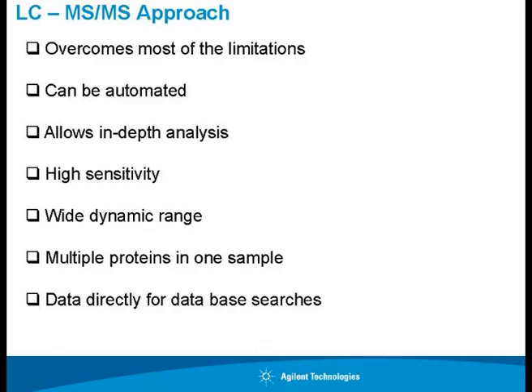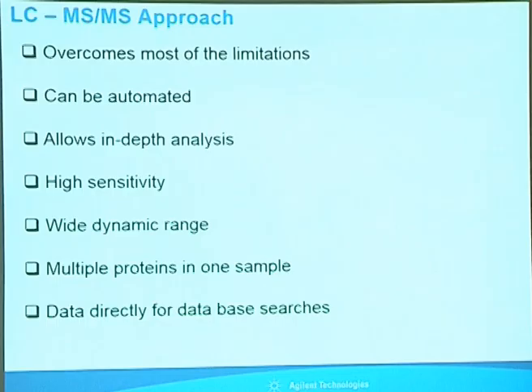It allows in-depth analysis. It is highly sensitive. It has a wide dynamic range, okay. And you can run multiple proteins in one sample at a time. And it is in a way compatible with database searches, like data as such can be submitted into a database and you can get the identity annotations.